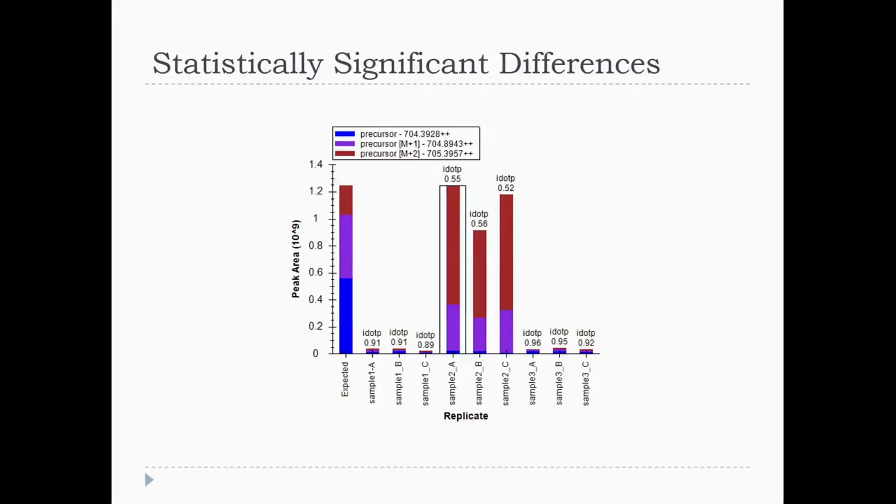And I found peptides that really there shouldn't be any way they could be changing, because this peptide, although I don't label what peptide it is, is not part of one of the proteins. So it's part of the yeast background, which wasn't changing. And when you look at this, immediately what draws your eye is, what's the hypothesis of what could be going on here?